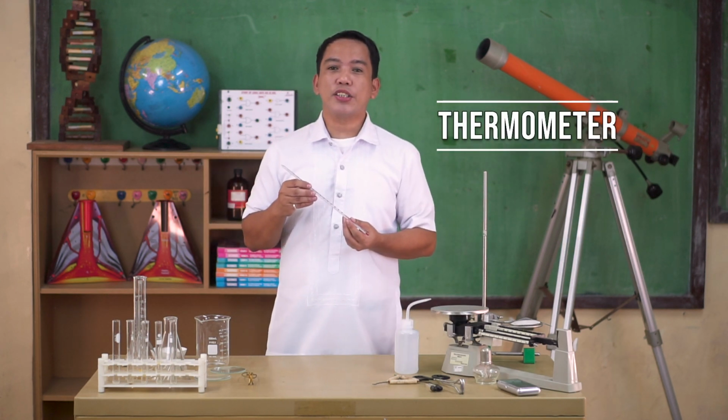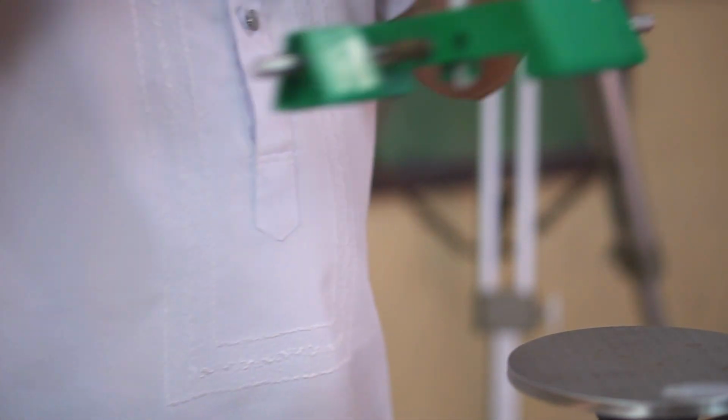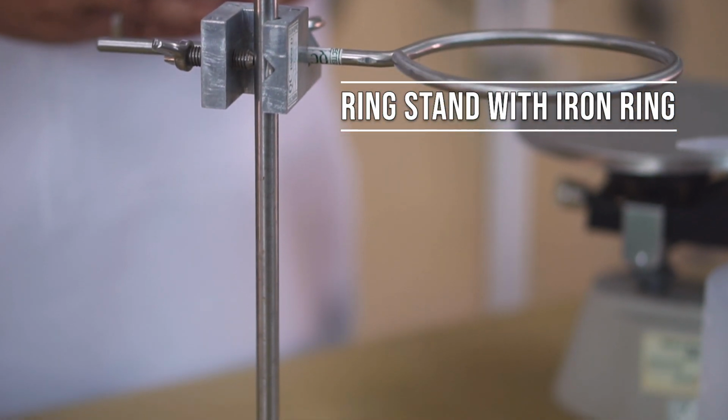Thermometer is a device used for measuring temperature. Ring stand with rings are used for holding pieces of glassware in place.